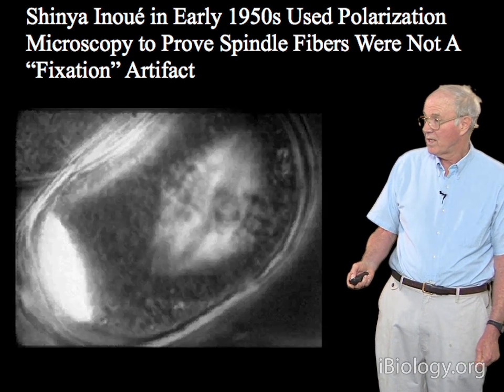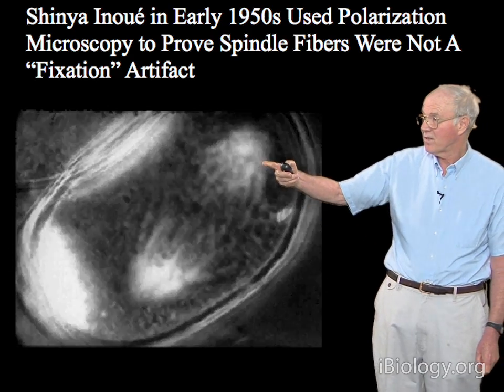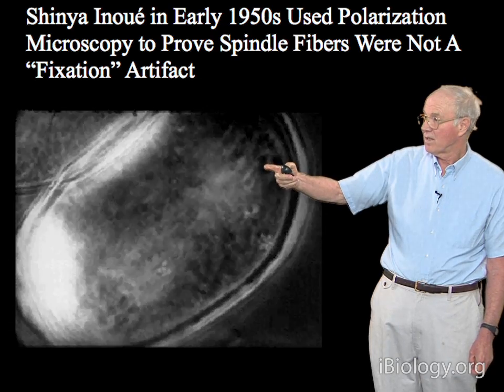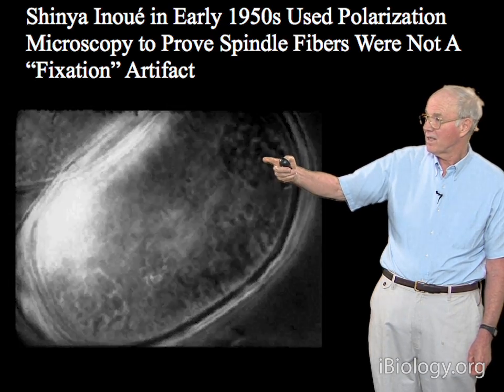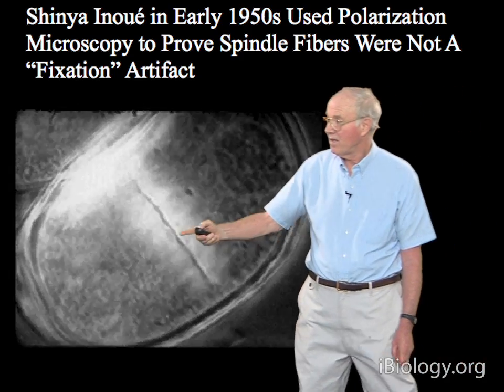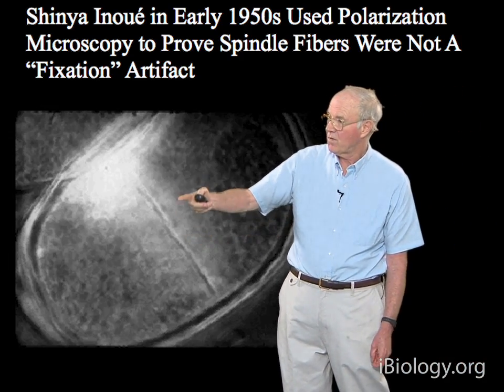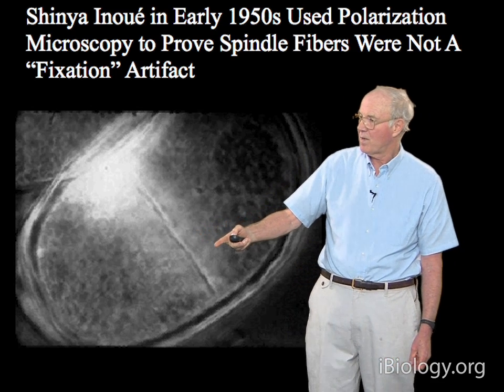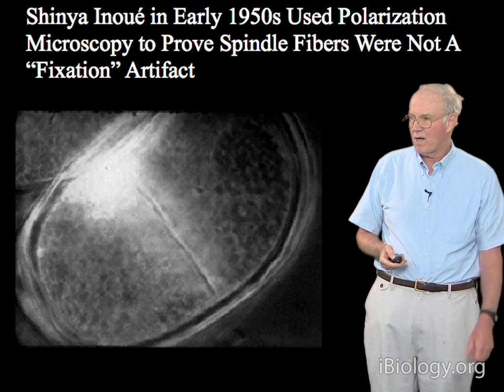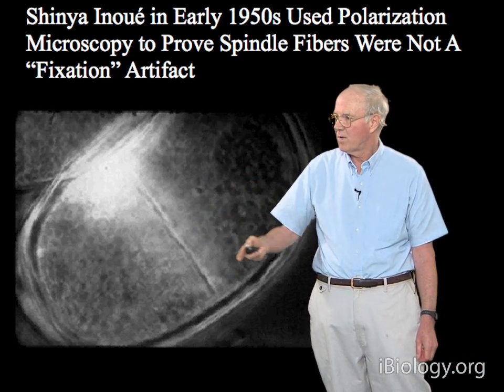And so this movie of the lily pollen mother cell, and the brightness here is the brightness of the spindle fibers that shorten and pull the chromosomes up to the poles until you make the nucleus. And then another bright array forms here at the position where the cell plate is formed, and we now know this is a mid-zone microtubule complex that's used to support microtubule motor trafficking that brings vesicles that builds the cell wall and the new plasma membrane.